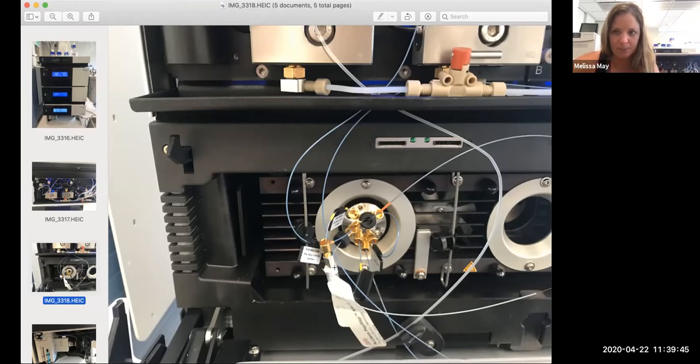This is our trap column. And the trap column is a pre-column, which allows us to trap, or basically purify our sample a little bit more, especially because we're doing complex samples that maybe have a lot of contaminants in it before we inject it into the instrument. We also have a line coming in from the autosampler, which is right here. And then this line right here in 10, which is going to the waste. These other two ports, this one is plugged, so there's nothing there. And these just create a loop to also close the system off.